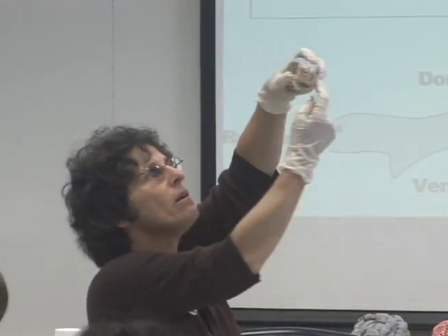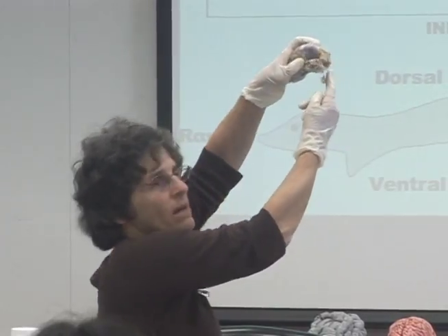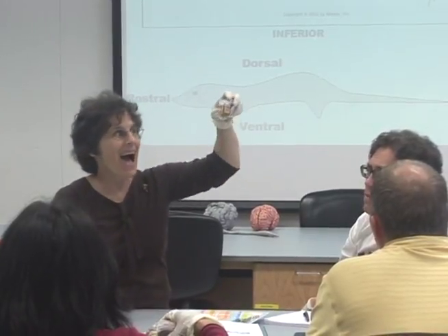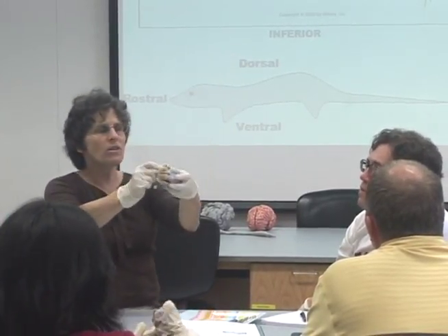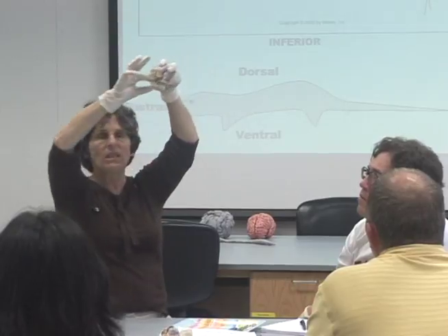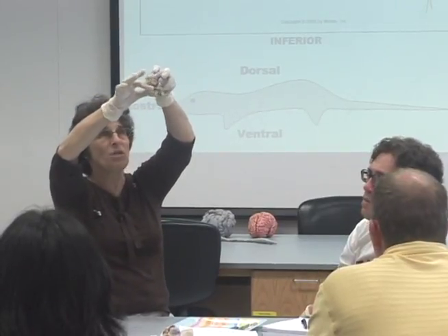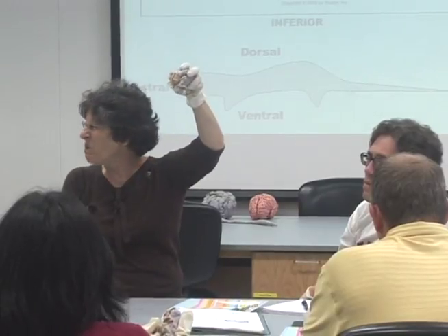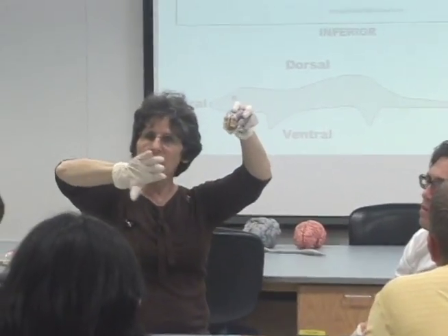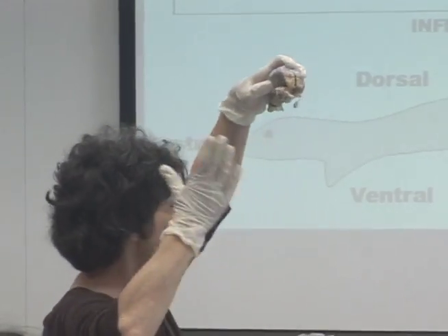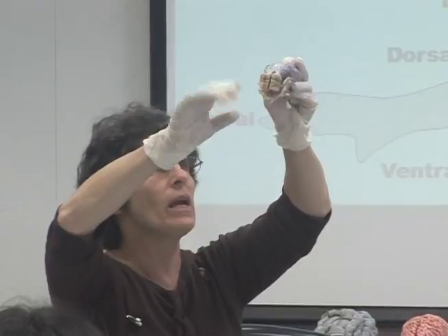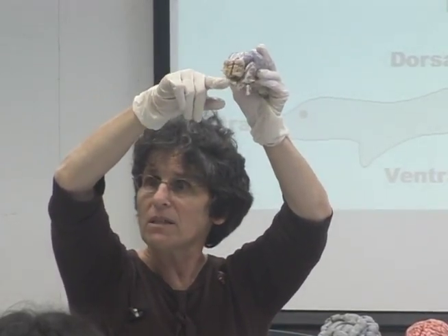They're not basal ganglia, which is interior. I'm curious what you might think these are. Muscle going to the eye — exactly. This looks just like meat; it's full of fat and it's got striated muscle going to the eye. I didn't see it on any of the other specimens, but sometimes it's there and students say, 'What's this?' The eye is on the other side of the skull — the skull's been taken off, so we lose the eyes in these dissections. Very few dissections do I ever see with the eye attached to the brain, but in the sheep brain you very often get eye muscles.